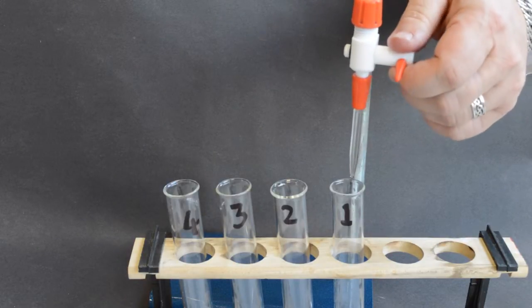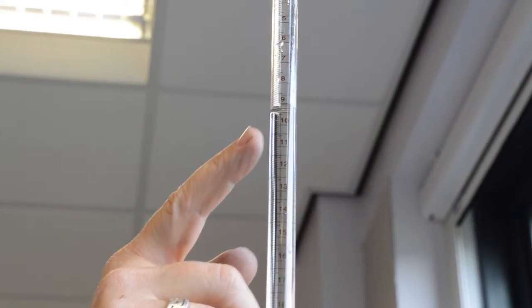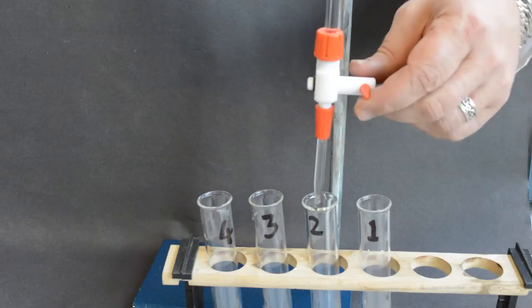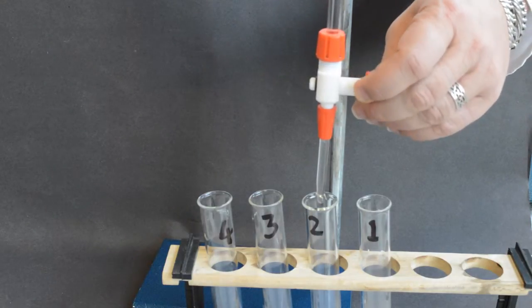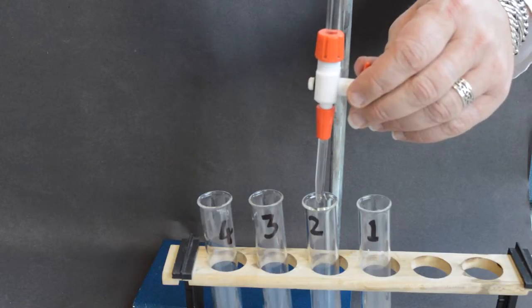Note the remaining volume in the burette before continuing. Repeat the process of adding distilled water to the tube labeled two. This tube requires eight milliliters of distilled water.